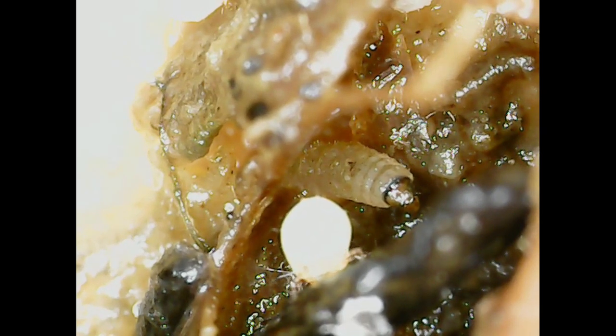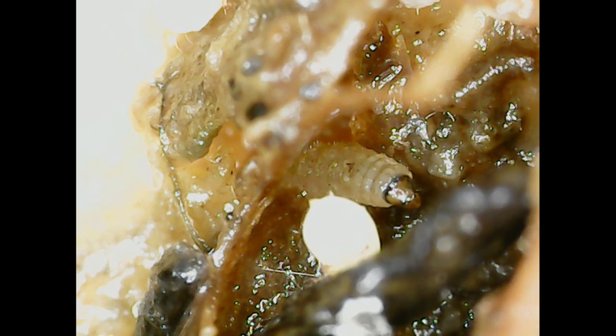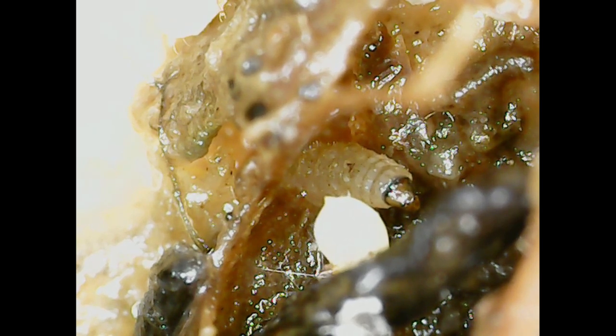That is the head of something, a maggot maybe? Where are you going? I can't even see with my naked eye what I'm actually looking at. I'm trying to look down where the microscope is. I can see the white specks, but I can't pick that little thing out with my naked eye. Oh, we got something else above here. Oh, it's another mite down in there. That one above here. Got a couple. Let's try and focus on them.